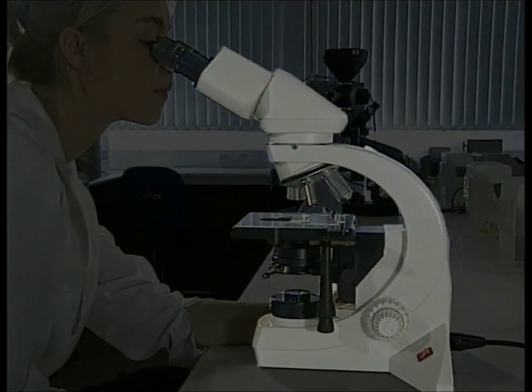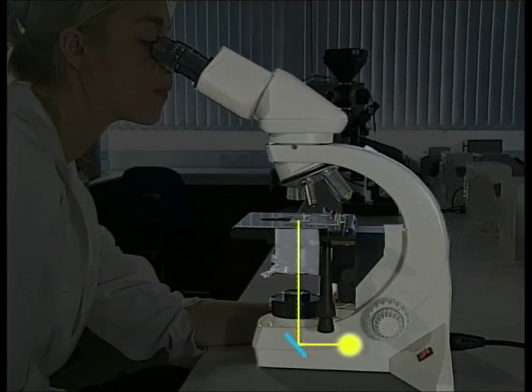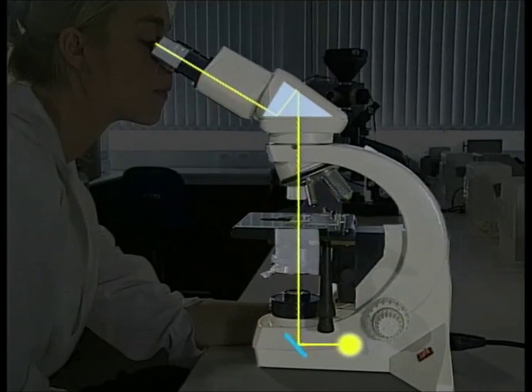All microscopes contain the same key components. These are a controllable light source, a substage condenser to focus the light onto the specimen, an objective lens which resolves detail in the image, and an eyepiece which focuses the image onto the eye.